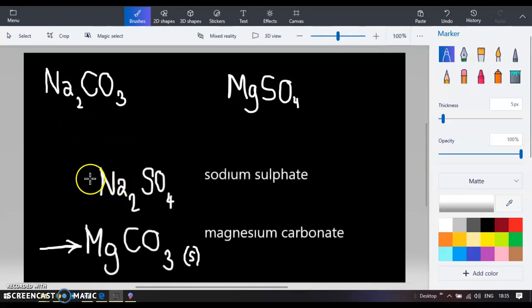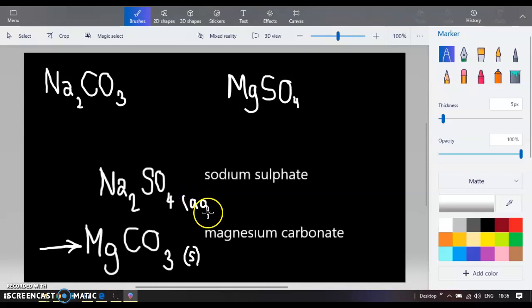Hello Year 9s, this video that I'm asking you to watch is an accompanying video for the YouTube video that I'm asking you to also watch, which is the actual experiment to make an insoluble salt by precipitation. So the insoluble salt that's being made in the video is magnesium carbonate. The other product that is made is soluble sodium sulfate. I'm just going to put aqueous there.